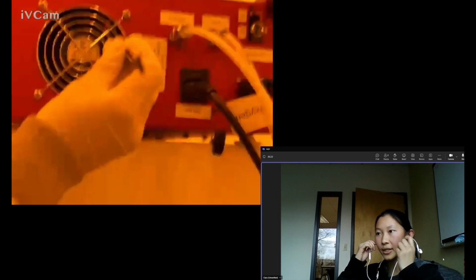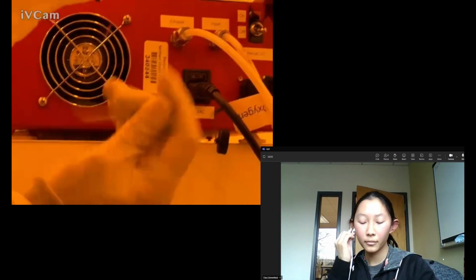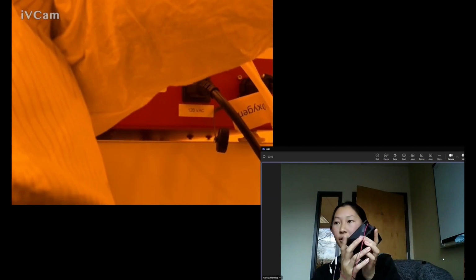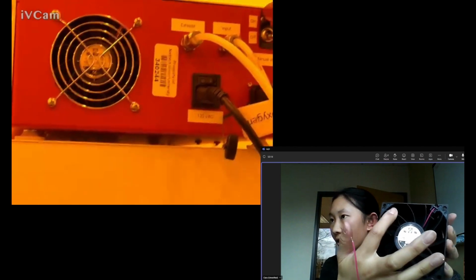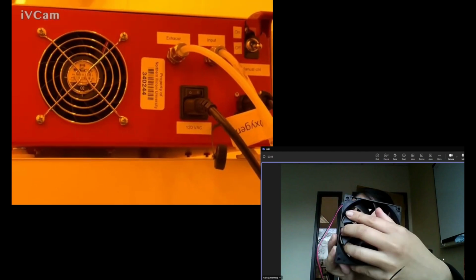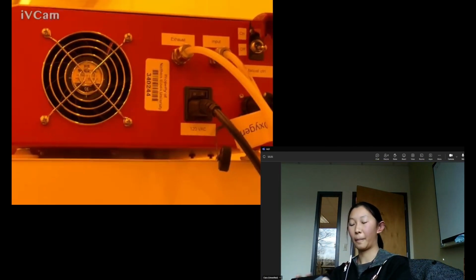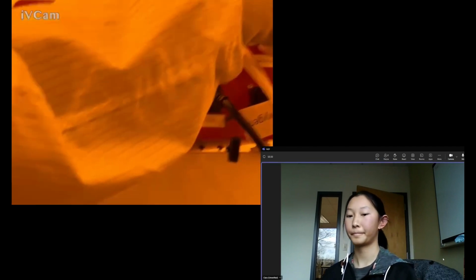Let me look, one second. Okay, yeah. So I have one right here. I don't know if you can see it, but this grill here, these are stationary. Oh, okay. Stationary. But then this one on the inside moves. That's running. Okay. That's good. Yeah, that's fine. You want me to turn it on? Oh, yeah, sure. You can turn it back on.